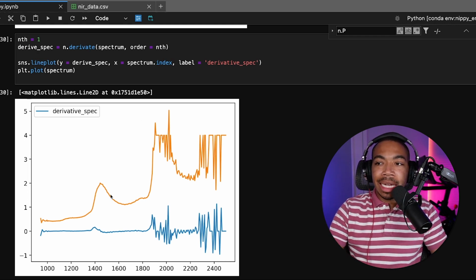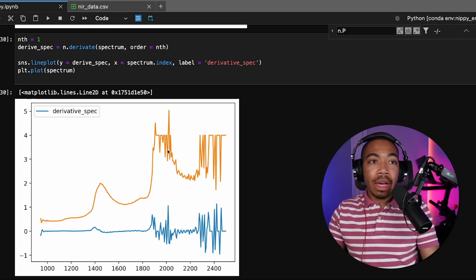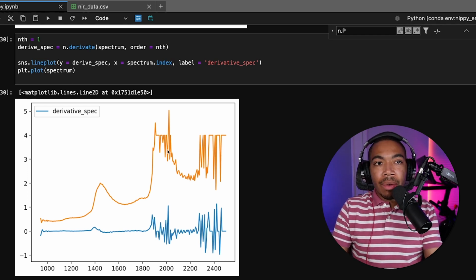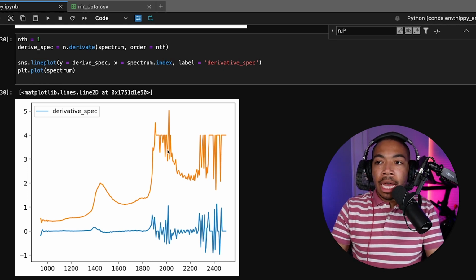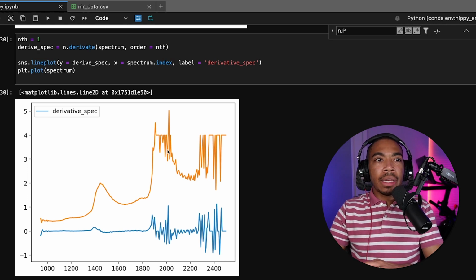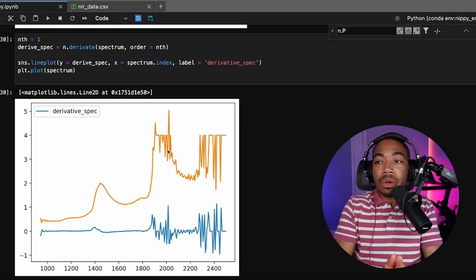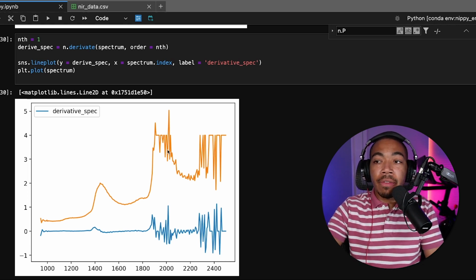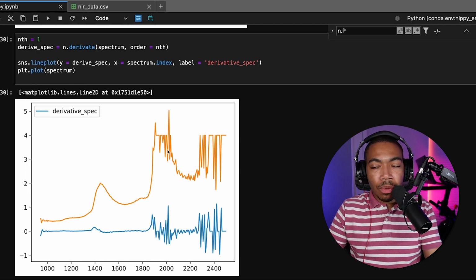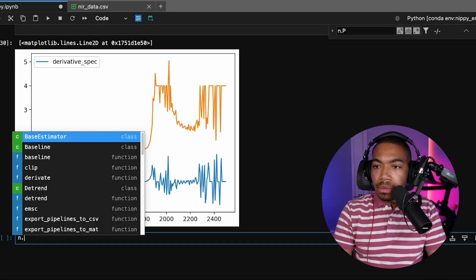Because this data is not that great to begin with, I'm not going to get into that, but I do have a video on building out the signal processing techniques, and this Nippy library is just one way to do that. SciPy has another set of techniques that are really easy, really convenient, work on data frames pretty readily, and achieve most of what this is doing, if not more. But again, we're just exploring this particular library for now. So let's see what else we want to do.